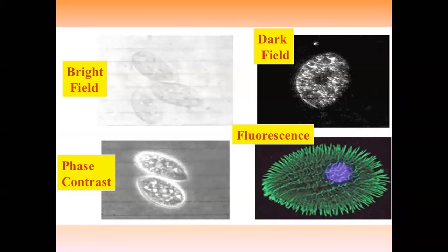That is one important feature, because any sample that does not have the property to fluoresce, if you subject it to fluorescence microscopy, you will not be able to see the image. Any sample which has the property to shine in a dark background, only that kind of specimen will be seen in fluorescence microscopy.